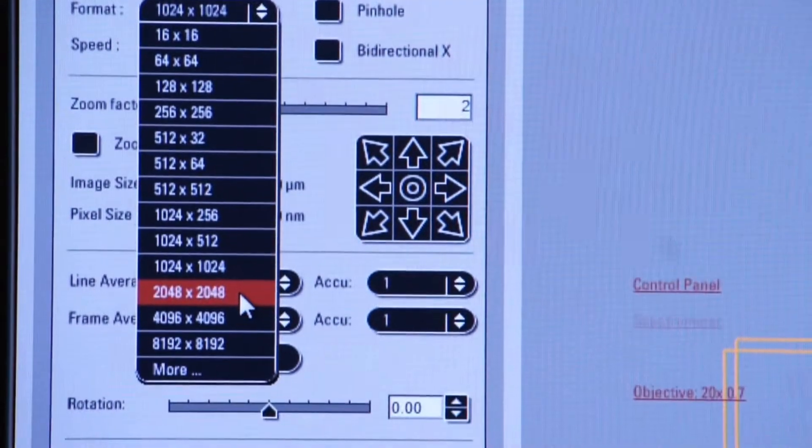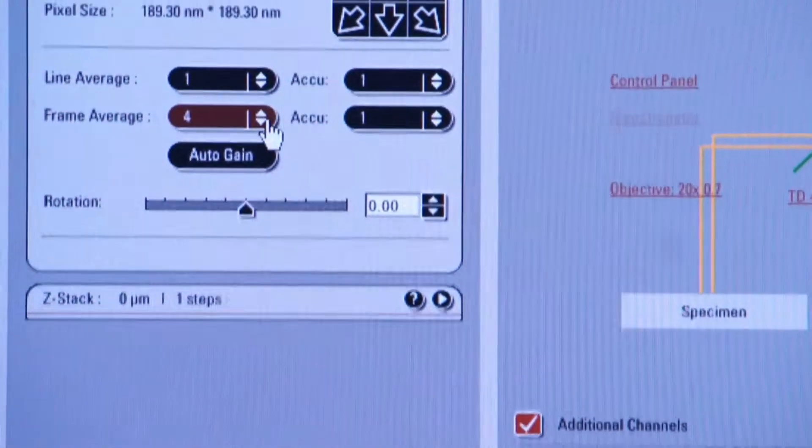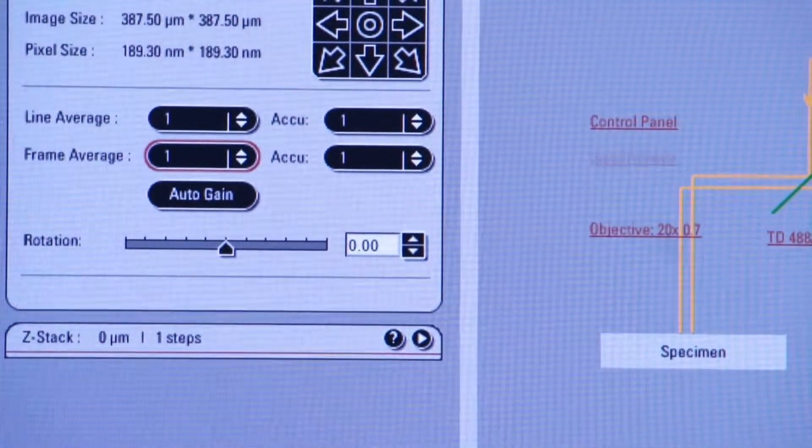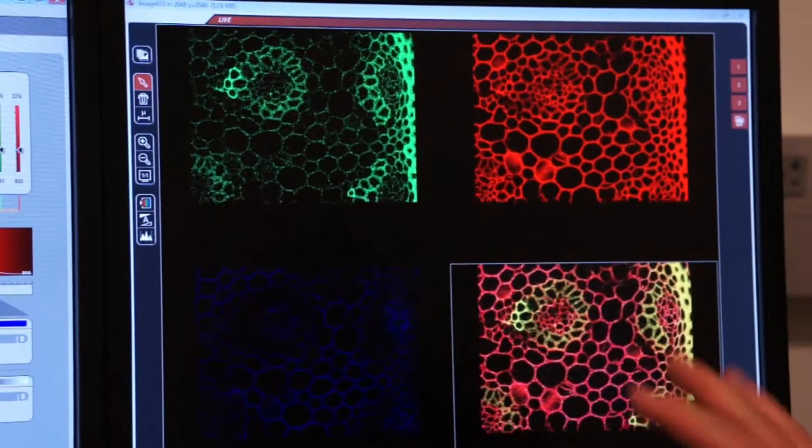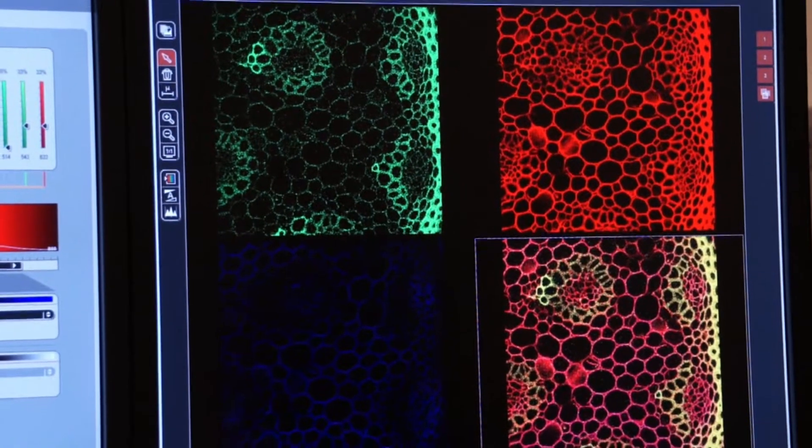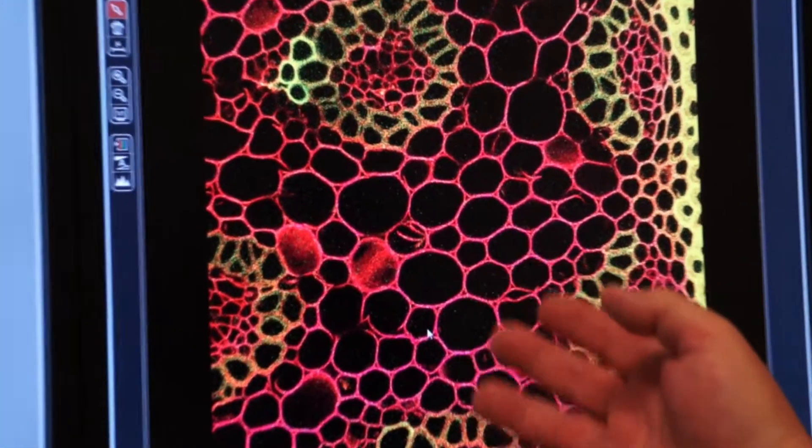Let's do a 2k by 2k image and we will change frame averaging back to one. Let's just capture an image at 2k by 2k and you'll see how grainy this is. But you might say, well Mark, we increased our resolution. How can it be grainy?